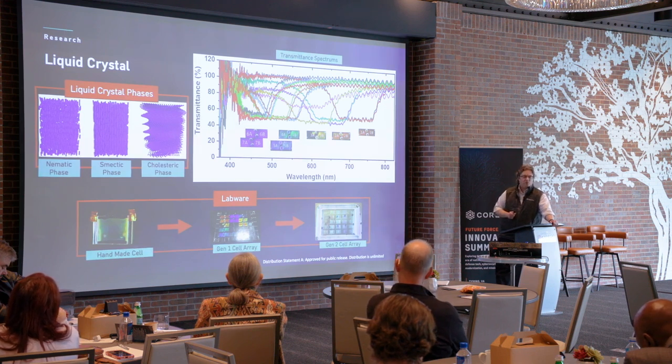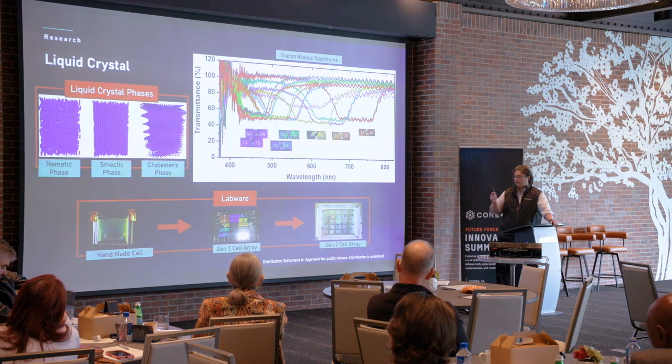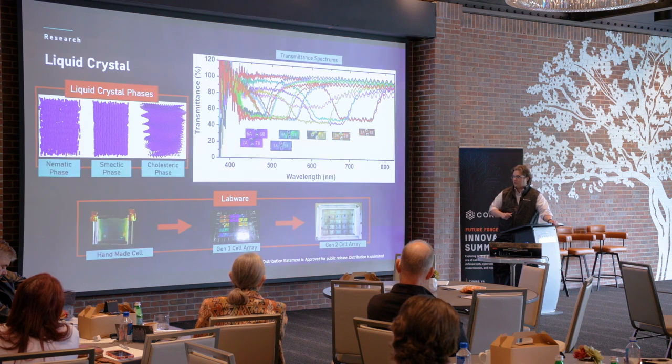The form factor does not work that well for the Cell 1 or the liquid handling robot. So we went back and I designed these first-gen cell arrays, which consist of 35 independent cells. They have the same dimensions as a standard well plate, since these units are generally built for biological systems, which use standard well plates primarily. But unfortunately, these designs were not ITO coated.